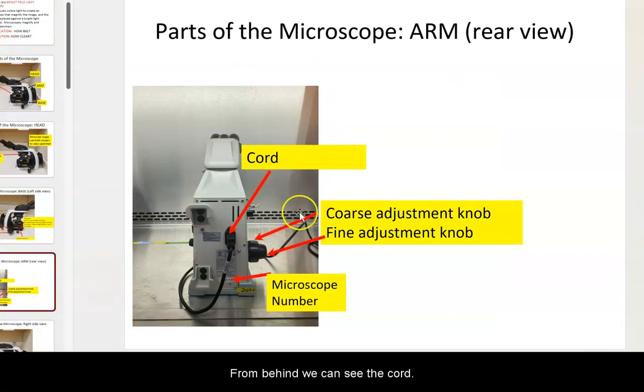From behind, we can see the cord and we can see the microscope number of our scopes.